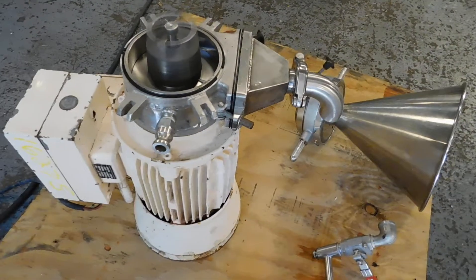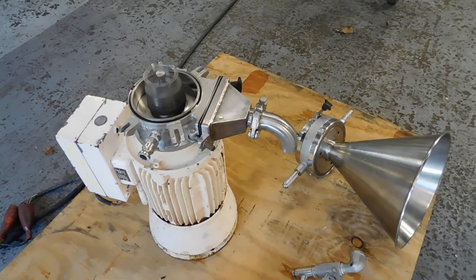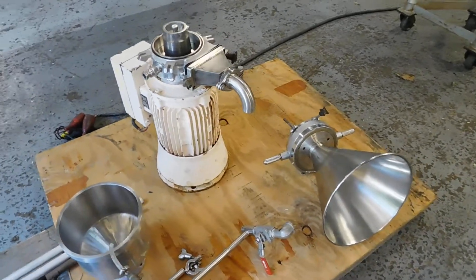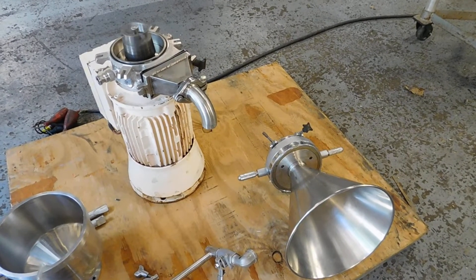And the fixed stator. We have lots of colloid mills in stock and every kind of other mill you might want, even imaginable, in processing for the sanitary industries. We look forward to having you visit our website at www.jamptrading.com, and we certainly look forward to speaking with you. Thanks for joining us for this video today.